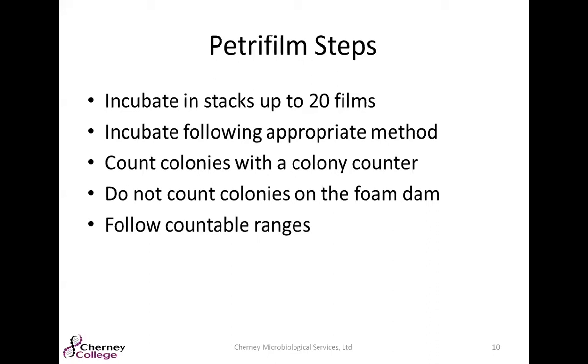And it's also recommended to follow countable ranges. For those of you not familiar with countable ranges, those are found in a reference method from the Compendium of Methods for Microbiological Examination of Foods. Each type of bacteria that you're dealing with has a recommended countable range, a low and a high CFU, that it's recommended that you count those bacteria within those ranges to get good results.